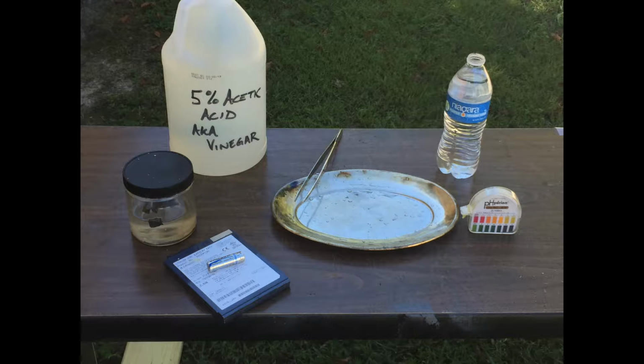The thin cut lithium from batteries will spontaneously ignite when exposed to water. Once the reaction is complete, we will use pH paper to test the residue, and we will neutralize this strong base with vinegar, a weak acid.